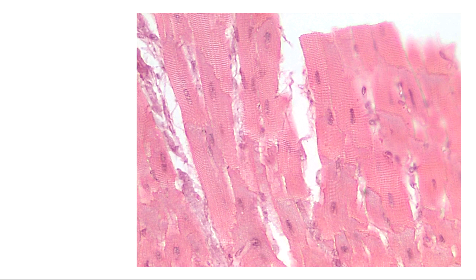I'm going to go back here. I don't think, yeah, so we don't really have adipose tissue on this cardiac muscle tissue slide. But again, you can see those stripes really well, and you can see those intercalated discs where those cells connect to each other. Because here, let's go back. The pretty skeletal muscle tissue, let's go to the ugly one. Notice when I look at this, how these cells are really long. There's none of the chopped up intercalated discs. Really long cells. They're kind of falling apart. We can see some places where they fall apart, but there's not the branching pattern.